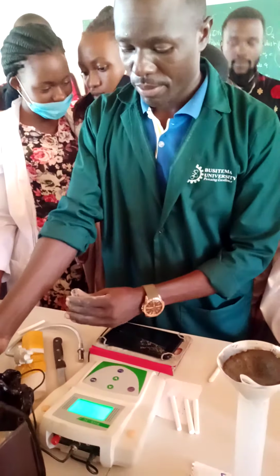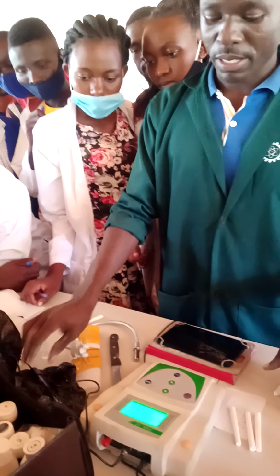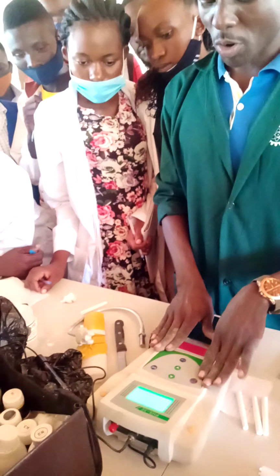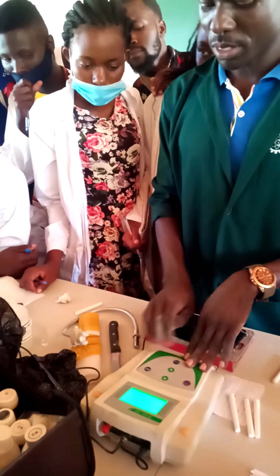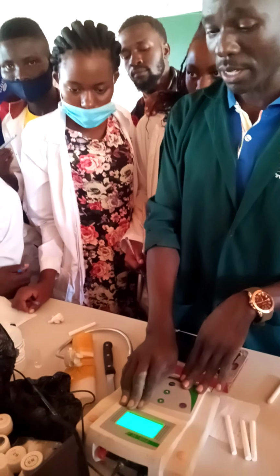This is called the probe or the rod, and it has a sensor inside it. This is the screen. This is the on button and the calibration button. Then this is also for regulating the pH here.